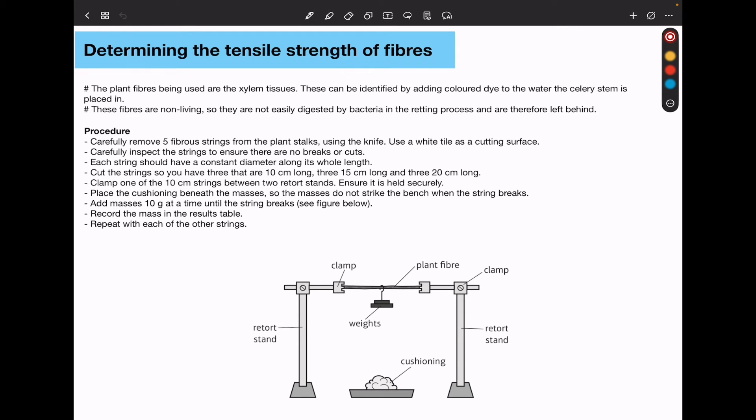Cut the strings so you have three that are 10 cm long, three that are 15 cm long, and three that are 20 cm long. This is going to depend on you. When you're describing in the exam, it depends on you.